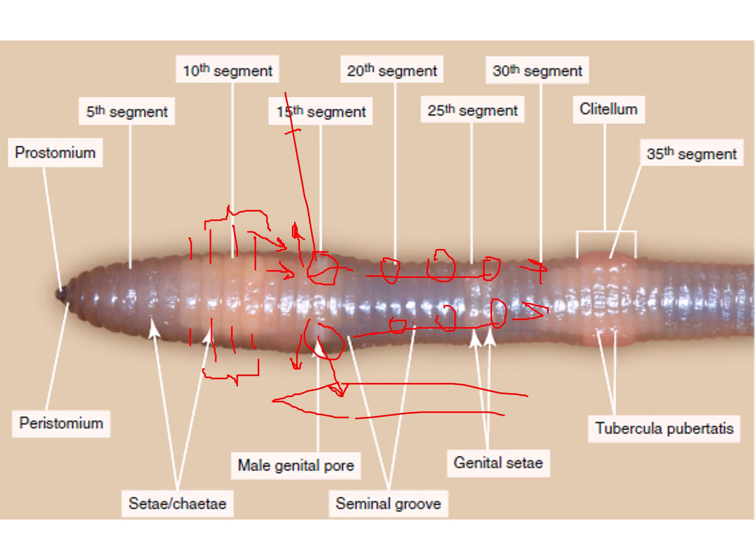These sperms would later fertilize the eggs of that earthworm. The sperms of this individual were stored in the spermatheca of the first earthworm, and they remain stored, and when the eggs mature, they get fertilized by the sperms of another individual.